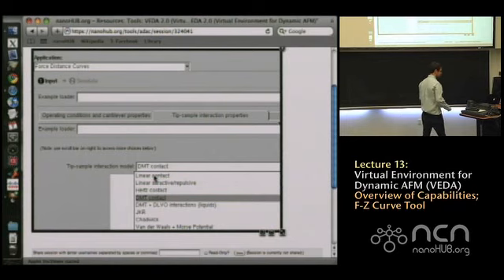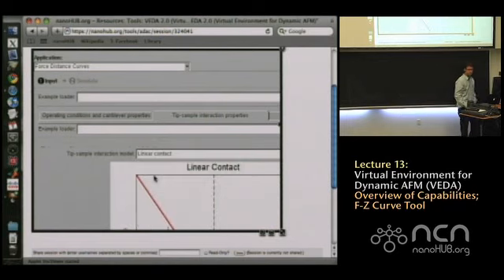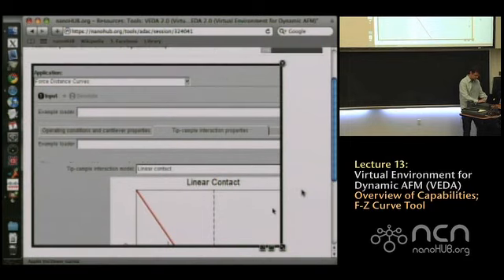Just to explain what linear contact means: we haven't really talked about this when you do contact mechanics, but our contact mechanics models have been Hertz contact, JKR, and on Tuesday you heard Ryan talk about generalized Hertz contact for elliptical shapes contacting each other.